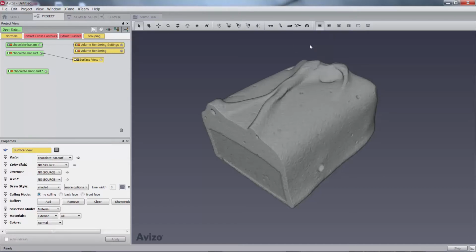You can also select a click sensitive mode. In this case, whenever you browse on top of the visualization, nothing is going to happen. But if you shift click at this particular location, you will get the XYZ coordinates of the visualization at this location, and also the intensity value at this location.